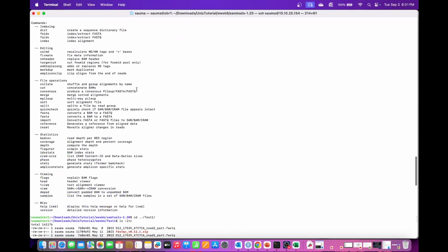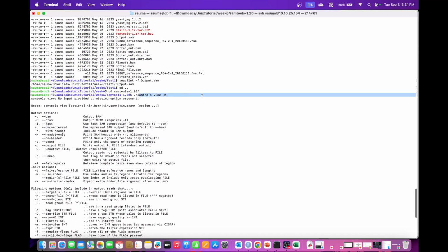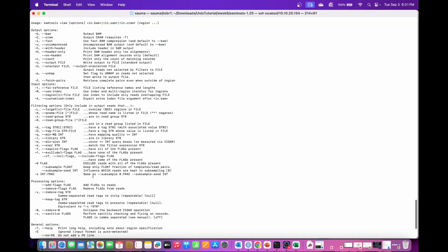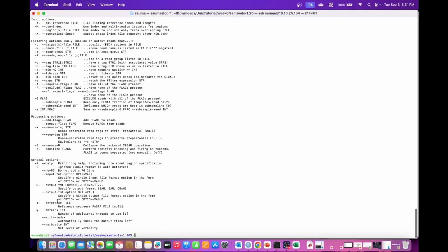These are SAMtools different types of commands. Inside those you can give different types of inputs as well. So this is the SAMtools view help command. We want to have an output of a BAM, so we'll give this in output. We'll use the auto detected format of the input. We'll not give the input format directly, and we'll use the view file and convert it to BAM.